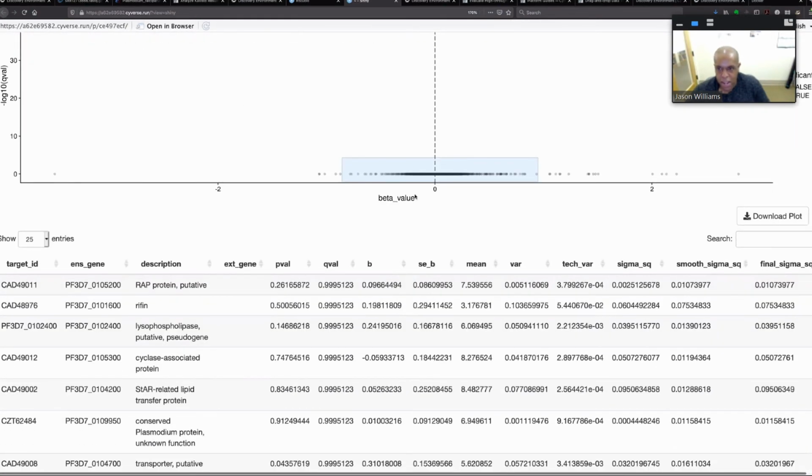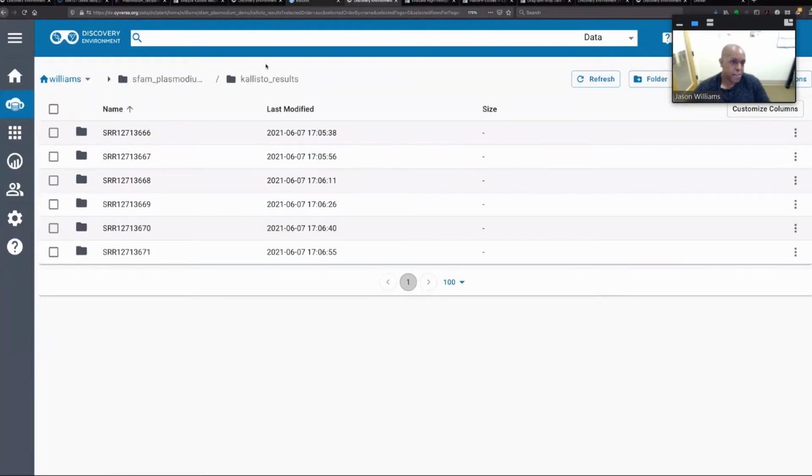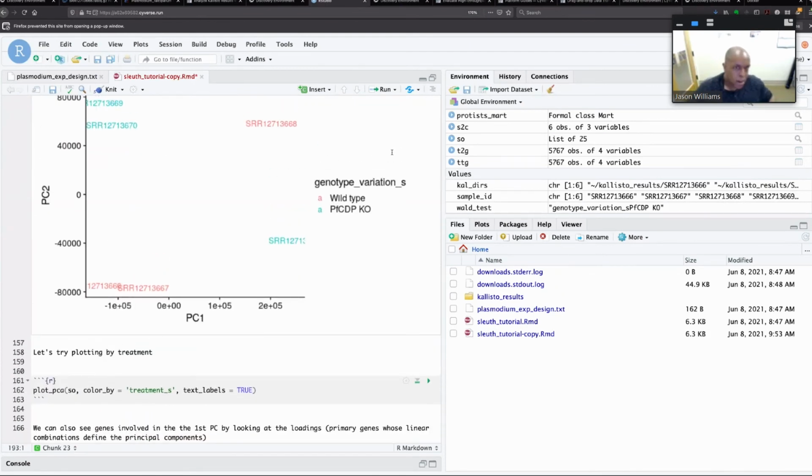If I scroll down, I could see what any one given gene is. And I suspect that's because we had this outlier. So let me try to correct that live and see if I don't totally embarrass myself with my R skills. I should write it down on a Post-it note, but it was this 6.8 and this other one I can't see. I think that's the 7.1.